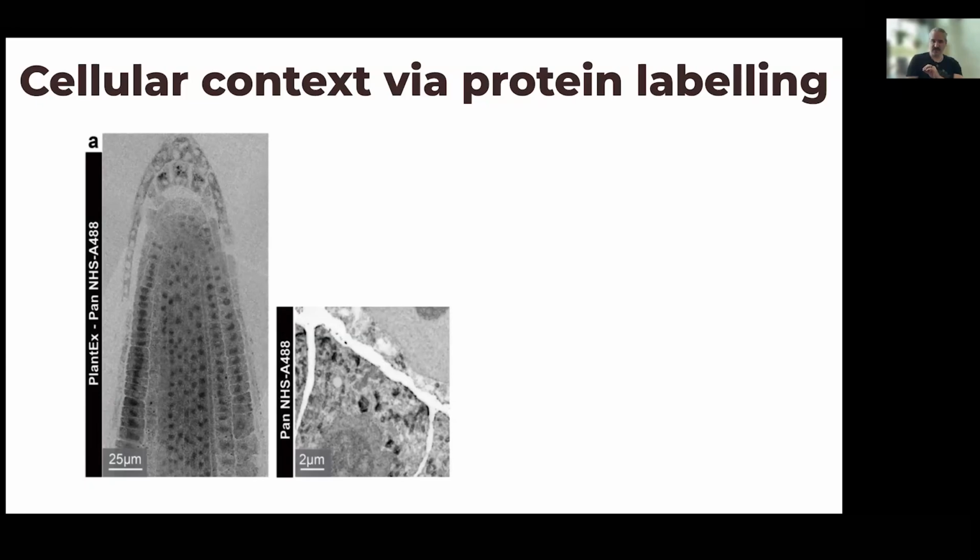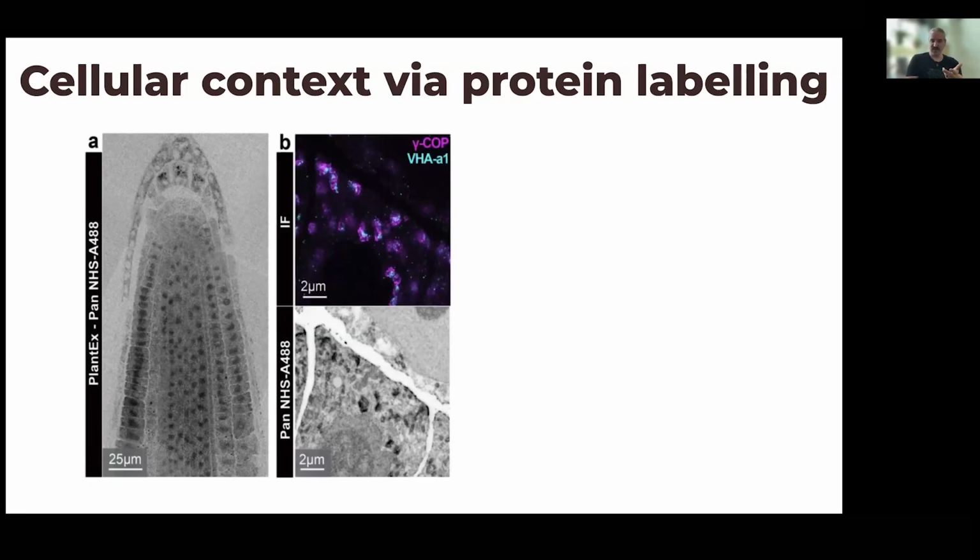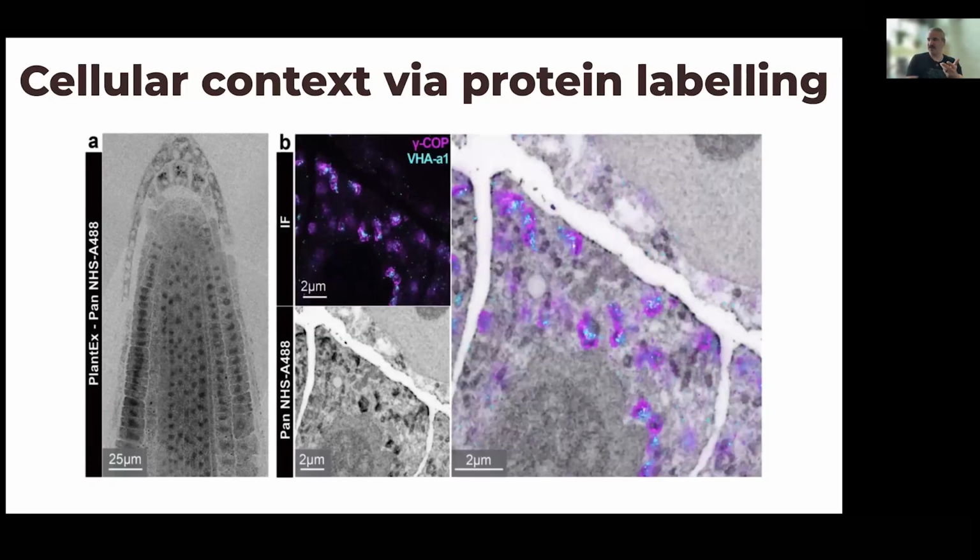are representing vacuoles, and now we can overlay the immunostaining with it, and we get this very nice colocalization and high structural fidelity analysis. This almost looks a little bit like electron microscopy because, again, we are looking at protein-dense structures as you would do in electron microscopy. But this is all light microscopy, the imaging.